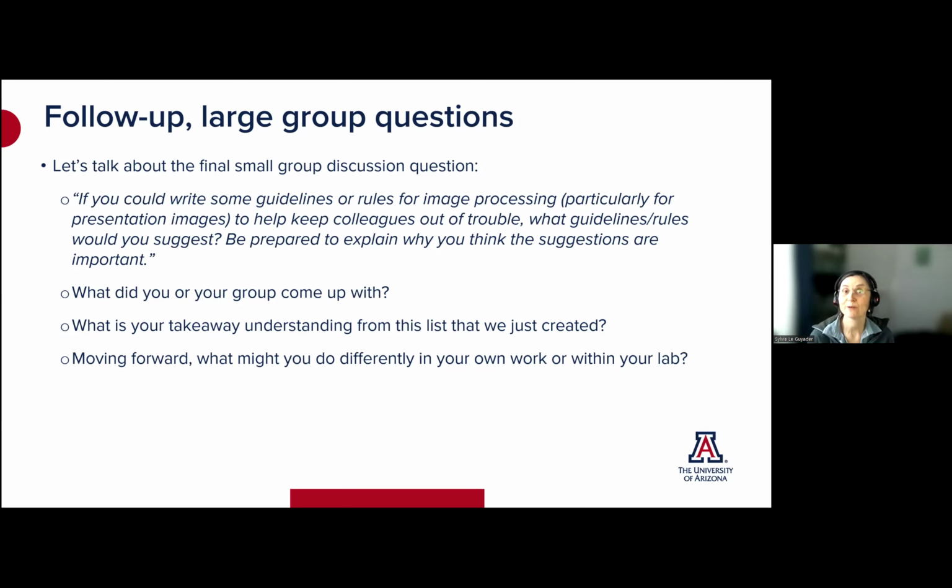And then you need to be able to find the data, right? Yeah, that's why you have file tools like OMERO, which make it a little easier. One of the things that I often find is in the United States, when we date a file, we tend to do month, day, year, and in Europe, it's typical to do day, month, year.